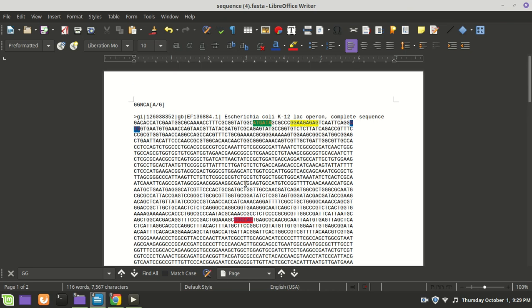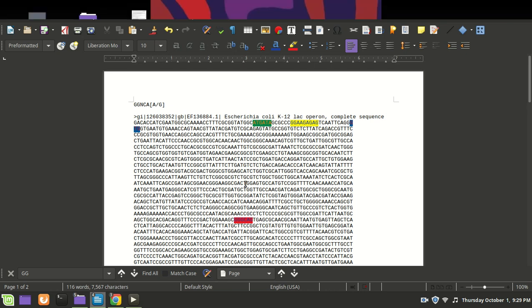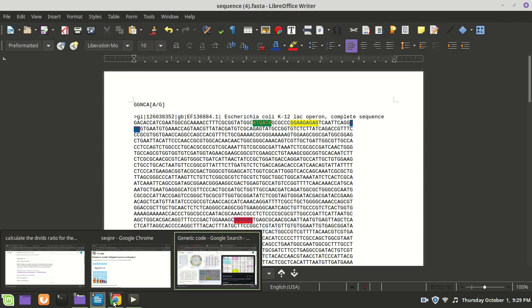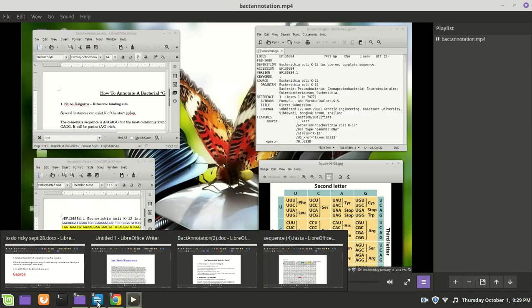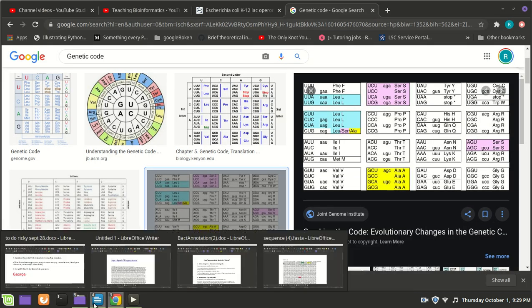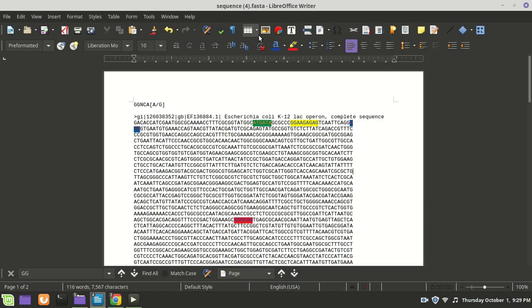So to begin your assignment, I would like you to find all of the Shine-Dalgarno sequences as the first assignment. I think, why don't you find Shine-Dalgarnos and starts and stops as your first assignment. That one's an easy one, because you can use the GenBank file.